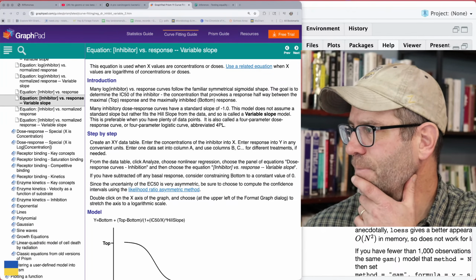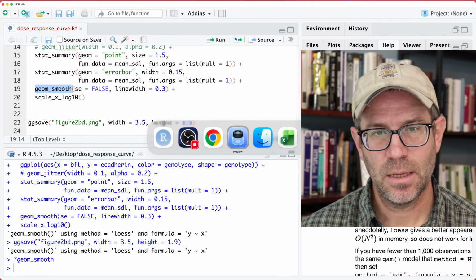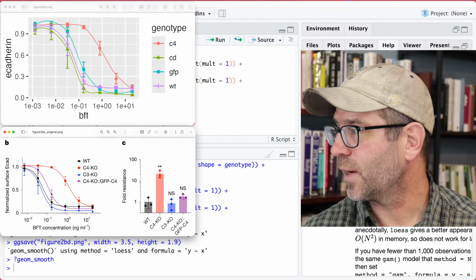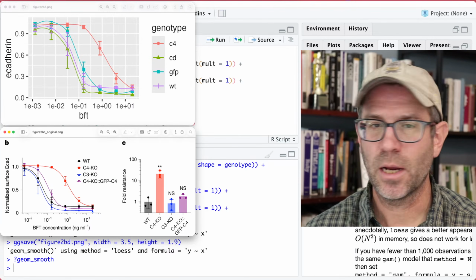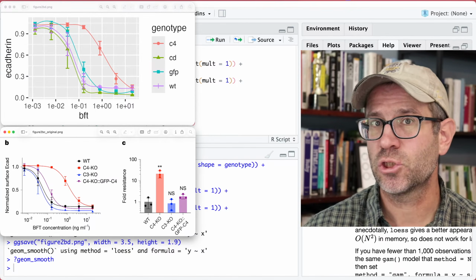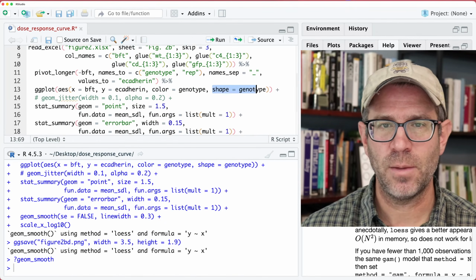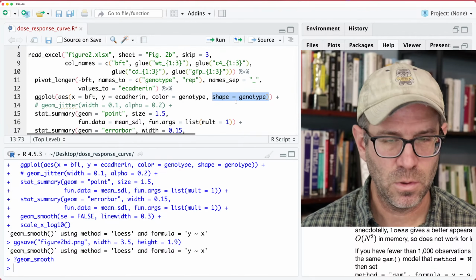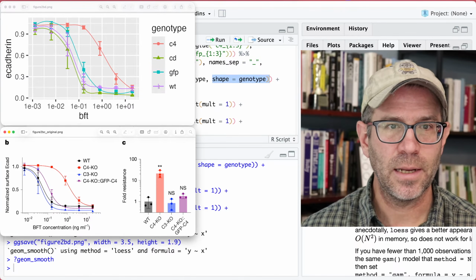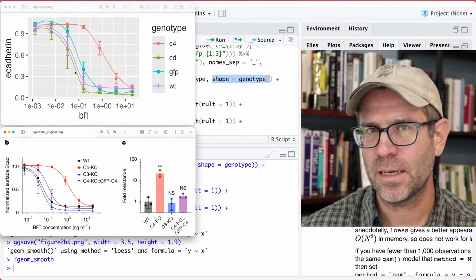And let me look at some comments here. So Mark is saying, it looks like I gave a shape vector in summary. The last is an inverted triangle. Right, so I haven't messed with the shapes yet. These are the four default shapes that come out when you use geom shape equals whatever, right? The first four shapes are circle, triangle, square, and plus. And we will be changing these as well as the order of the genotypes. But I want to get into the fit first.